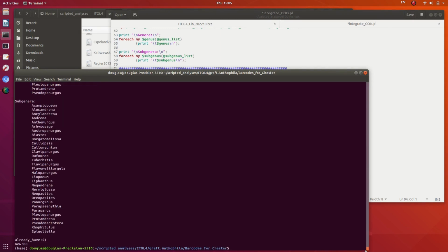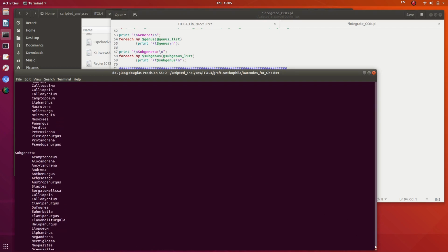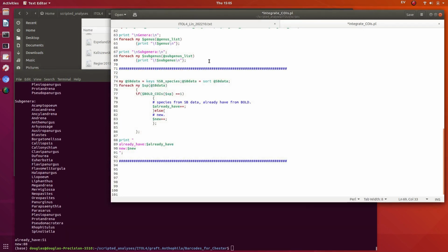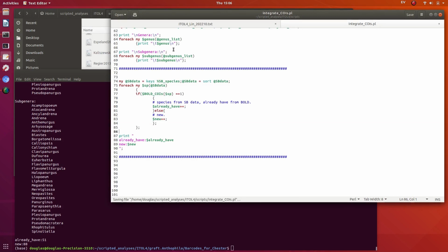Right, so I'm going to call this job done. What I need to do is talk to collaborators and get these names sorted out, and then we'll go from there and look at the quality of the sequences. If it's too short, and then just align them, and we have them in the pipeline. But not much else I can do right now. So, okay, that's all for today.